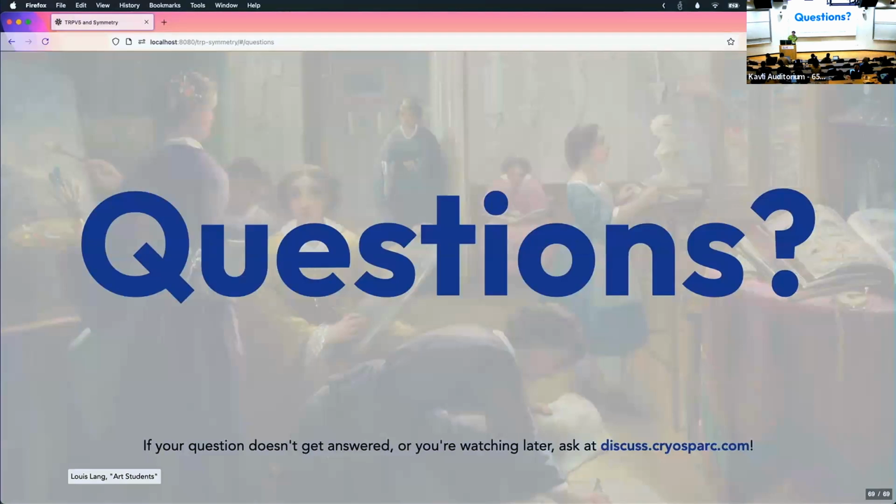pretty clean particle stack, using those kind of blurry or binned, for lack of a better word, but really Fourier cropped images, you can re-extract just the good ones. And I usually use a pixel size around 1.5 angstroms, so like a Nyquist of 3-ish angstroms. And then basically my policy is every time my map gets close to that, I think the conventional wisdom is 2/3 or whatever, but it's like I look at it and it looks, oh, maybe there's a little more.